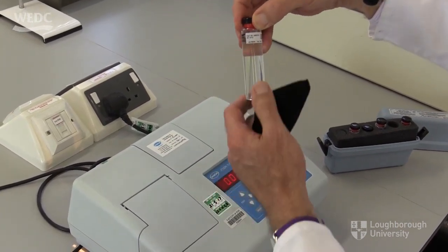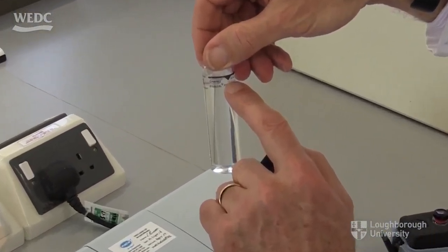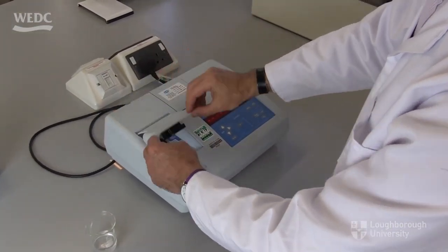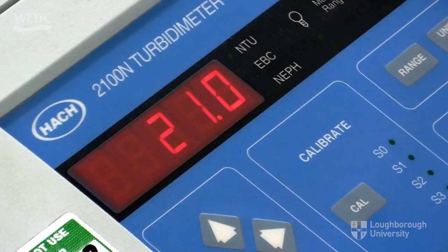Again, there is a line and a small triangle marked on the test tube, this time in black, and this should face you. This standard tube should have a turbidity of about 20 NTU, as previously specified on the label. Here it reads 21, but as it settles, it decreases towards 20. So this standard tells us that the turbidity meter is calibrated correctly. Turbidity is likely to change, and readings seldom need to be quoted to any great accuracy.